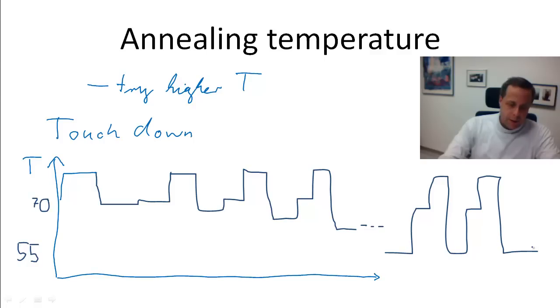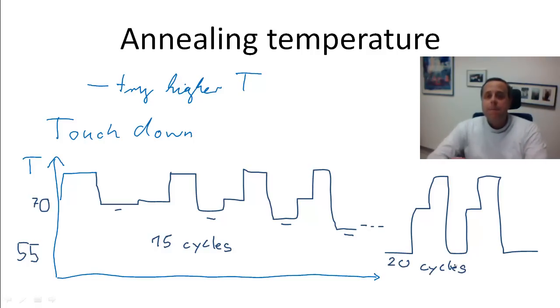So what you really do is you use some 15 cycles for the touchdown, as we call it. Now you realize why it's touchdown, right? It's touchdown because you lower the temperature for annealing each and every time. And after 15 cycles or so, you have reached a reasonably low temperature, and that will then you just keep going for another 20 cycles.